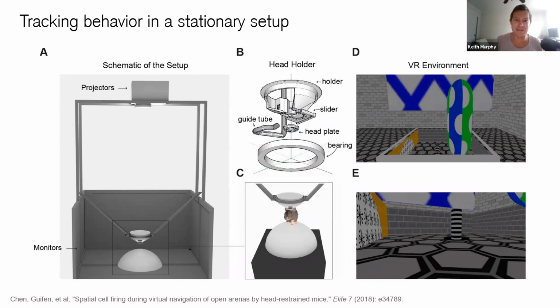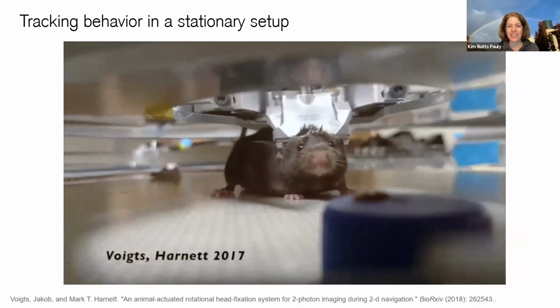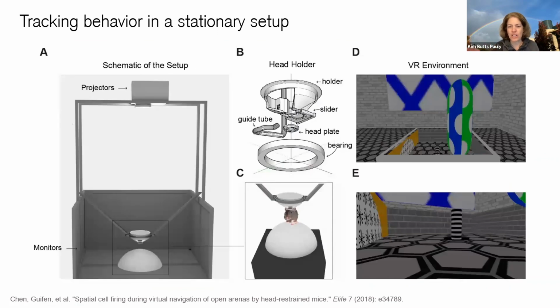It's very cool stuff. So you can actually set it up so they're running through a maze or figuring out a maze. Yeah, you can do a maze too. The possibilities are sort of unlimited there. It's really, really neat. But you can't really have a maze where one end of it has a treat and the other end does not have a treat. Because okay, so here I'll pose the opposite. You can, if you put a little tube in front of the animal's mouth that dispenses sugar water. So people do what you're describing. And it's not like the treat's really in the maze, but if you dispense it when they go somewhere in virtual reality world, they think that they found a treat. Yeah, so it's a cool abstraction of what you're proposing. Yeah, pretty cute.